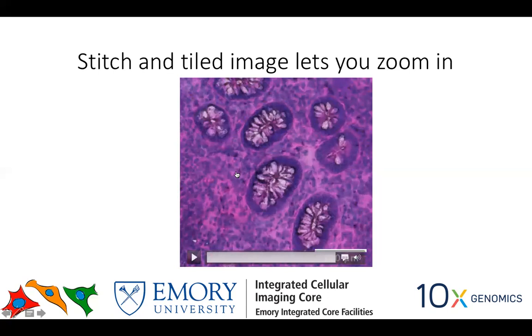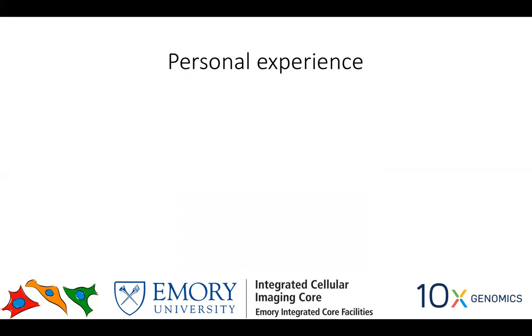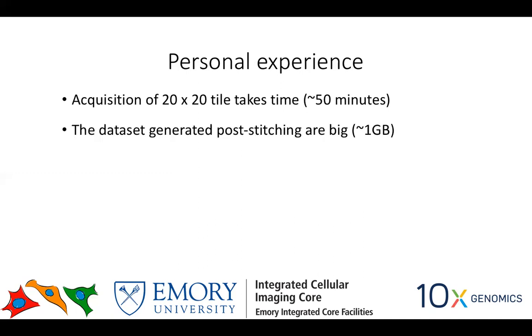So we get good enough resolution. And with the limitation of Visium, you are essentially looking at a 50 micron area when you look at the nucleotide signal at the end. Okay, in terms of my personal experience, it takes about 50 minutes to acquire a 20 by 20 tile image, which is what you have over there.